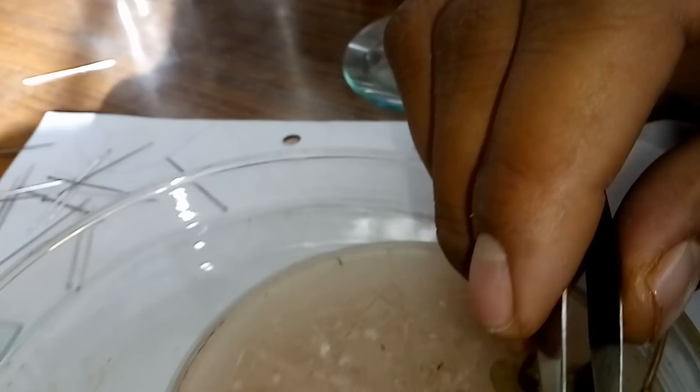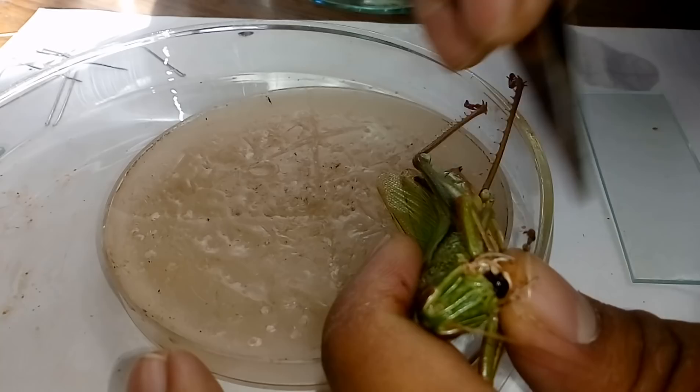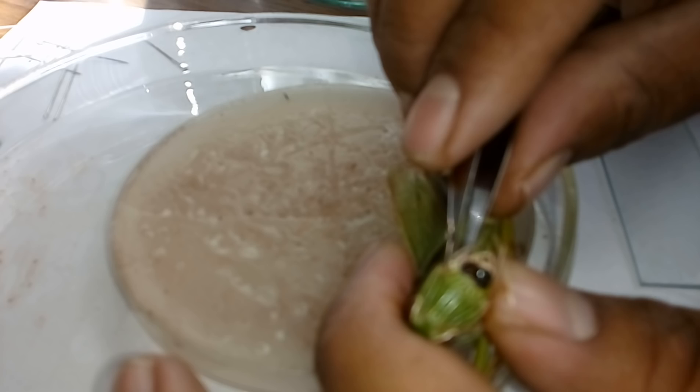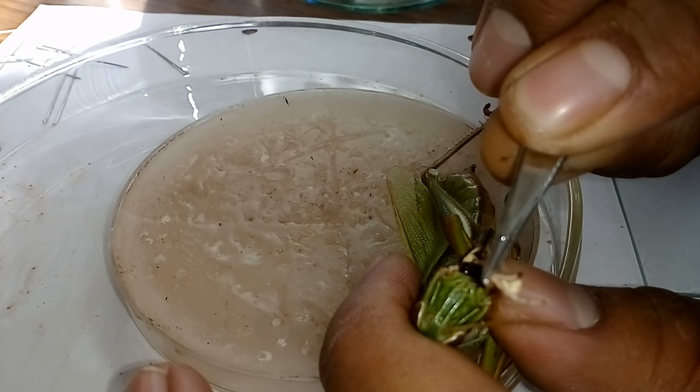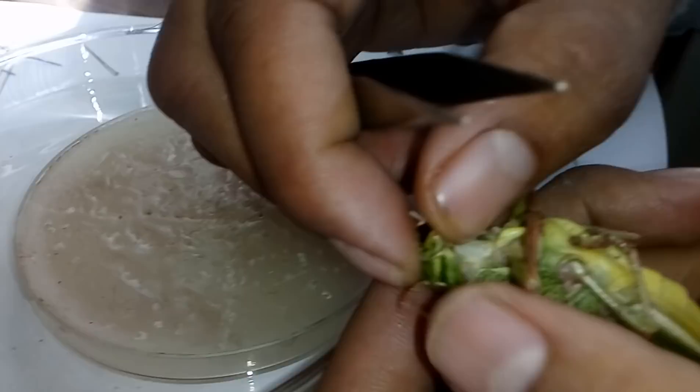Now we go for the maxilla. This small, black structure here — look carefully, with a black tip — this is the maxilla. For the removal of the maxilla, at the base of the maxilla we have to push it and then it is easy to remove. This is the maxilla. After sometime I will show it on the slide — that will be very clear. Again put it into alcohol after removal of the maxilla.